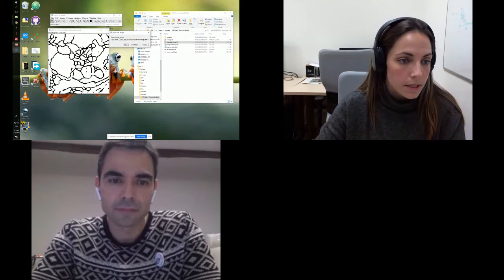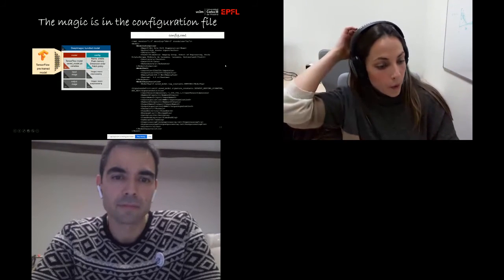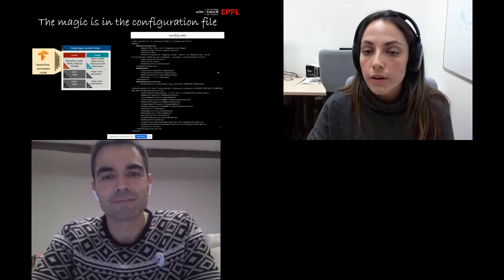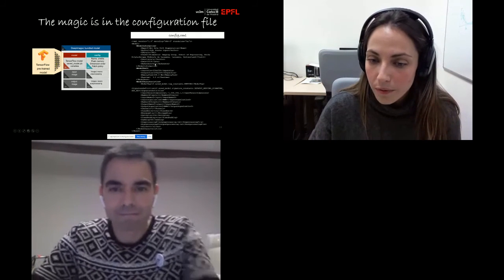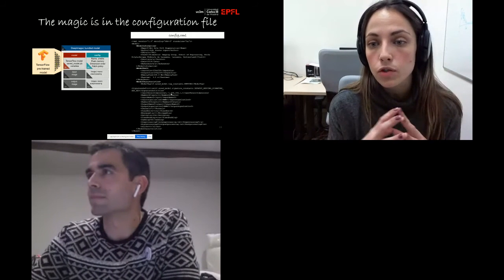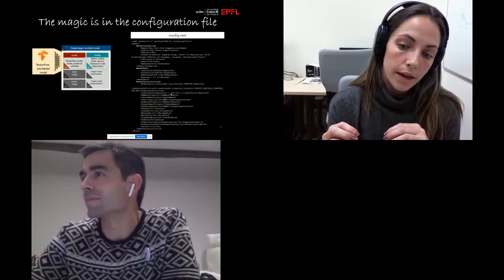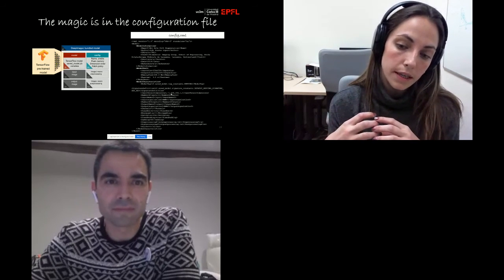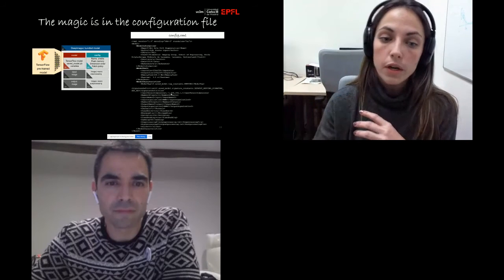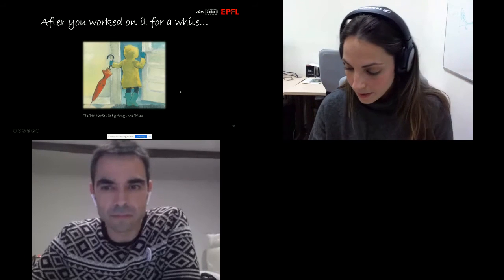OK, so I'm just going through the presentation. OK, so where is the key for all this to work? It is in a configuration file, and this horrible text file contains all the technical details that we need to run the model in DeepImageJ. So this stores all the information that the developer has to run the model in their Python code. And the reason why I'm showing this to you is because this is going to change.